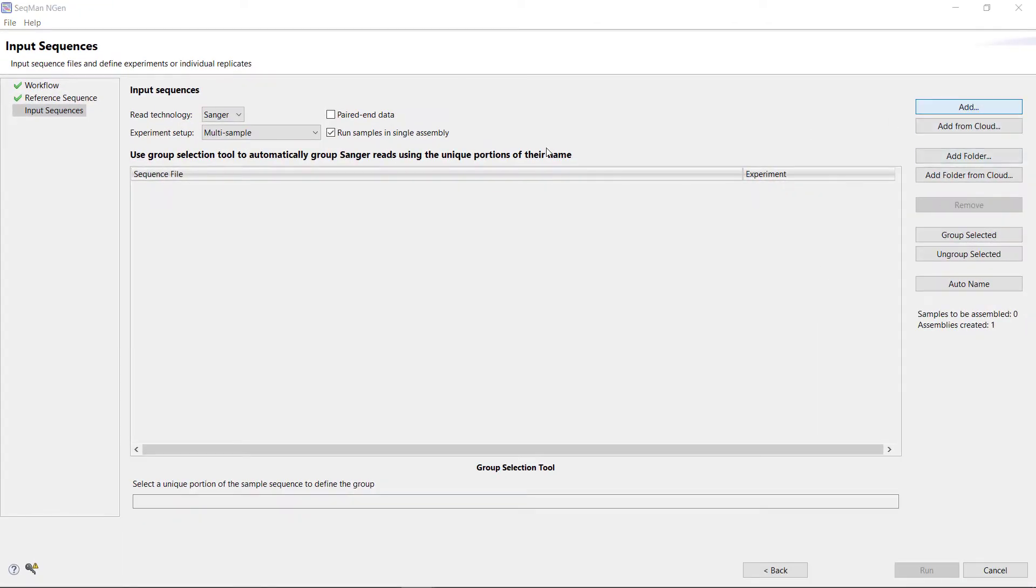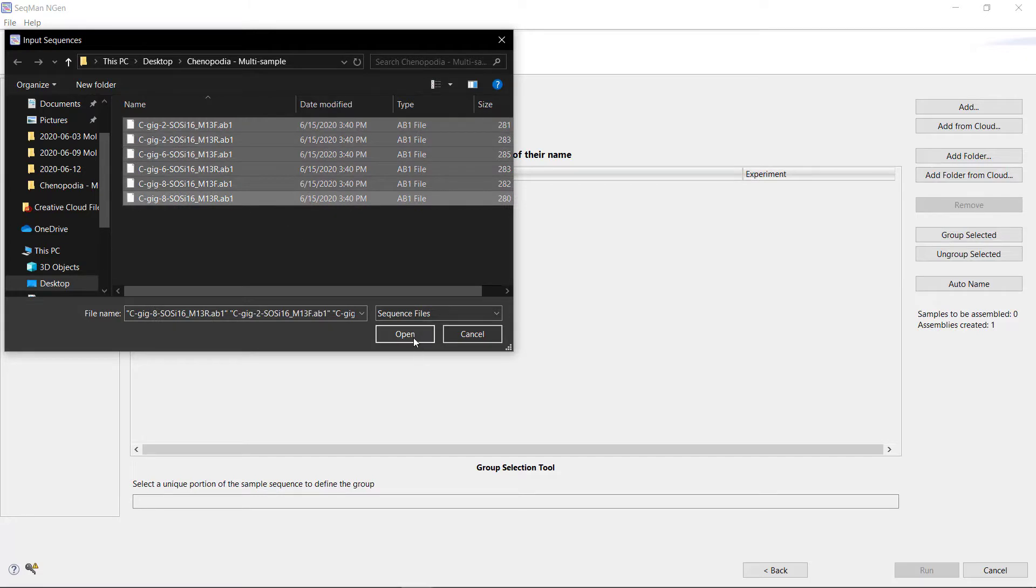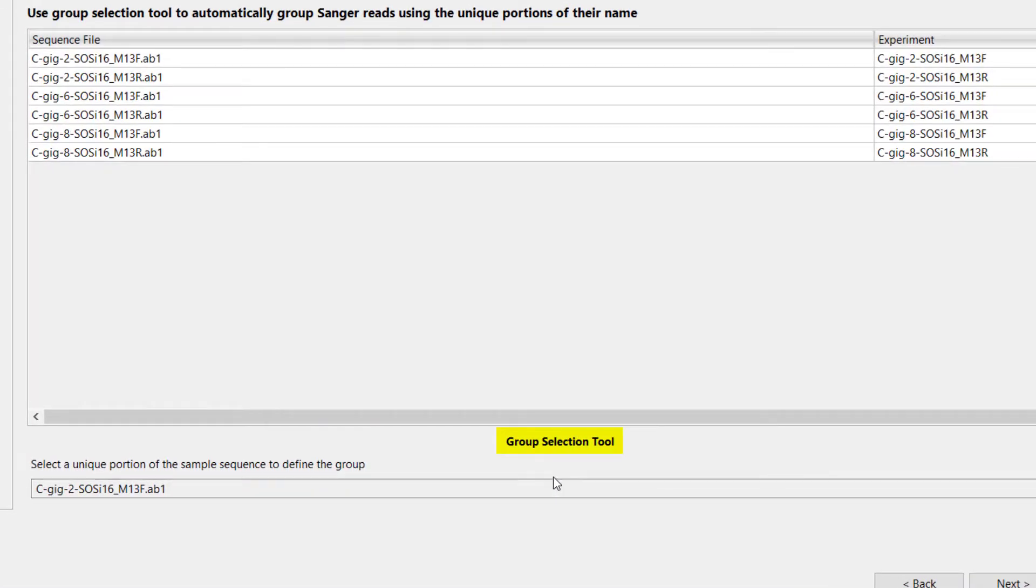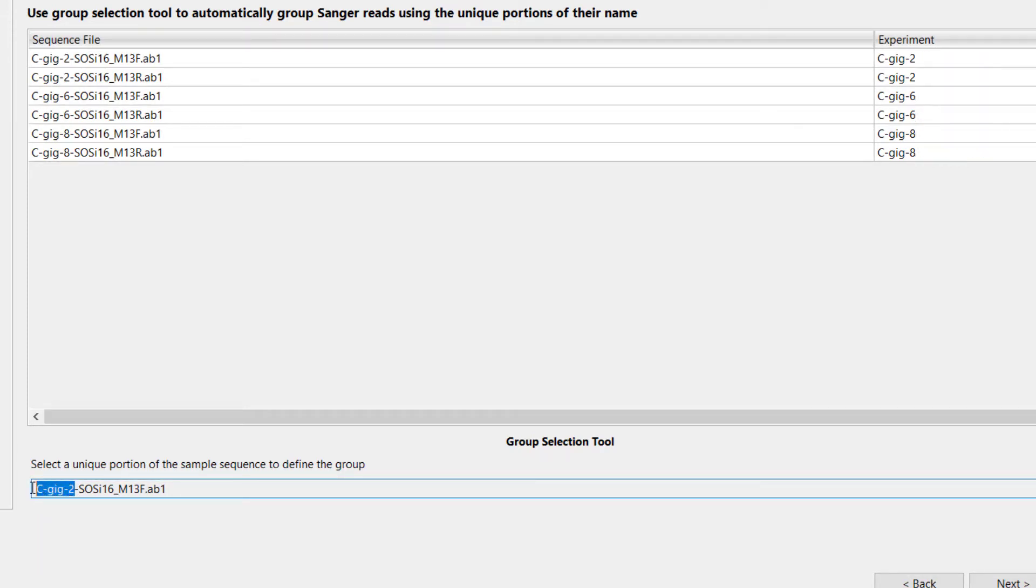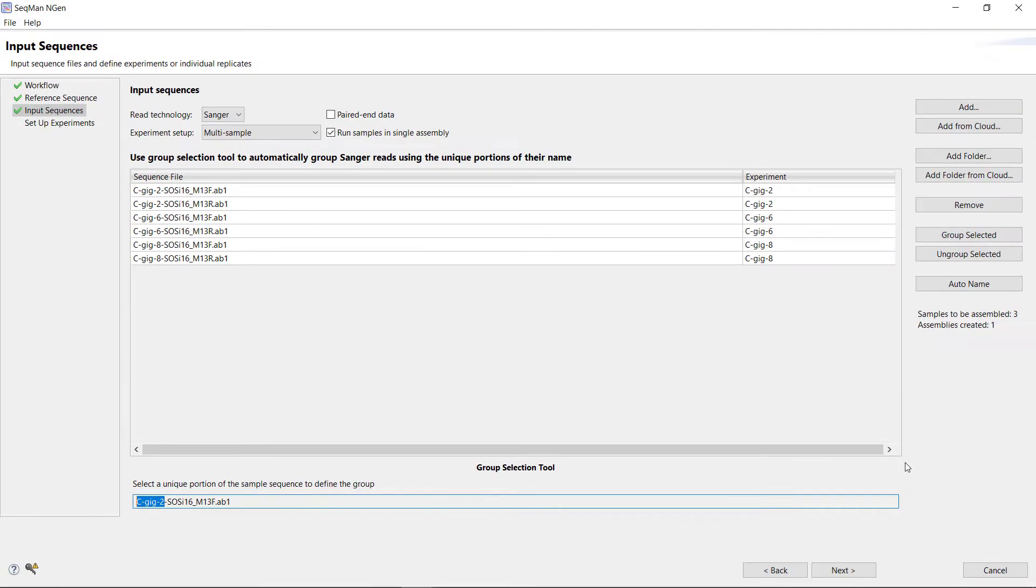Next, click Add and select your data files for the sequence data. In the Group Selection tool, I'm going to select a portion of the file name that identifies the sample. I will choose C-GIG-2 to identify my samples. Note that I have forward and reverse reads for each of my three samples.